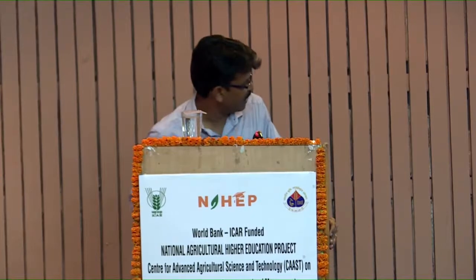You will very frequently find acronyms like PCR, Qpcr, RT-PCR, QRT-PCR. All kinds of combinations of letters and acronyms are created, and the literature is loaded with this kind of information. So students, I would like to make a clear-cut distinction here. Let's see what they really mean to us. PCR, all of you must be knowing, is polymerase chain reaction. And what is Qpcr? The Q stands for quantitative. So, quantitative PCR.